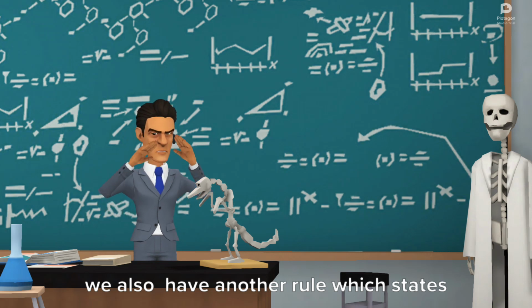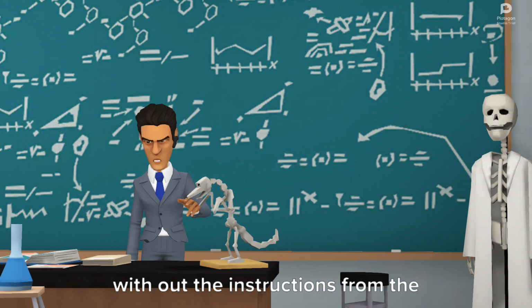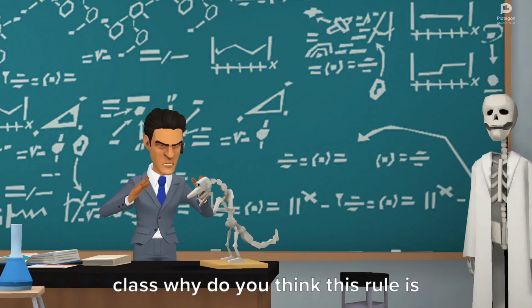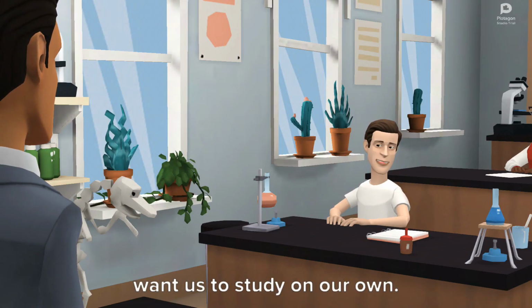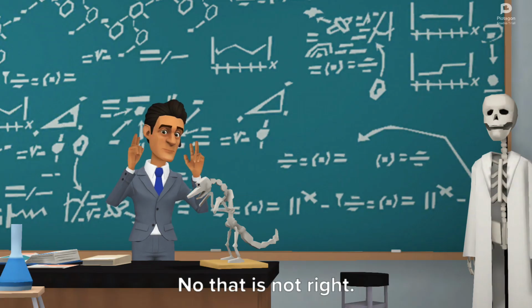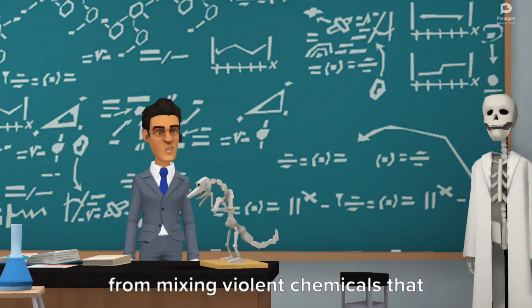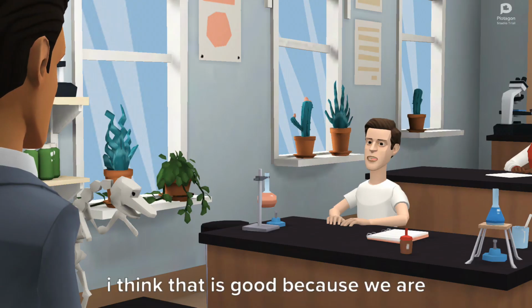We also have another rule which states that no learner should do an experiment without the instructions from the teacher. Class, why do you think this rule is necessary? I think it is just because they don't want us to study on our own. No, that is not right. This rule is important to protect us from mixing violent chemicals that can burn our skin. I think that is good because we are protected.